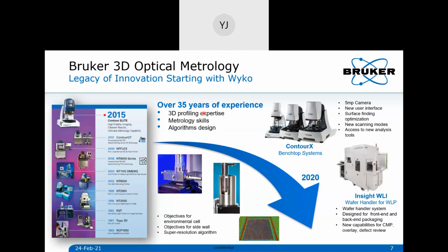If I remember correctly, this is the first company to have a commercial white light interferometry product. Interferometry, the name itself, is synonymous with very high resolution. Anything where you want very low tolerances in measurements, we rely on interferometry. Even for XY stage movements with very high resolution, you need interferometric stages.